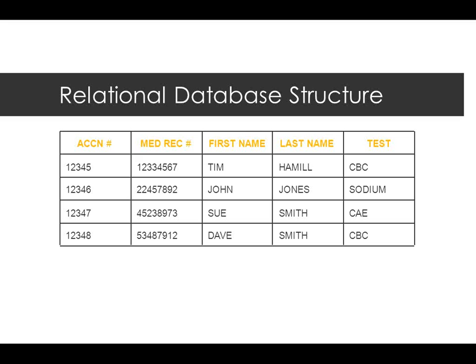In order to specify one point of data in this, all I need to do is give it the coordinates. So say this, and I can hit last name. So I just need two coordinates to specify each data point within that table, right? I just need to know what's on the X and what's on the Y.